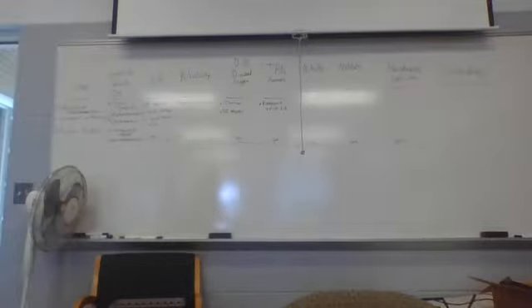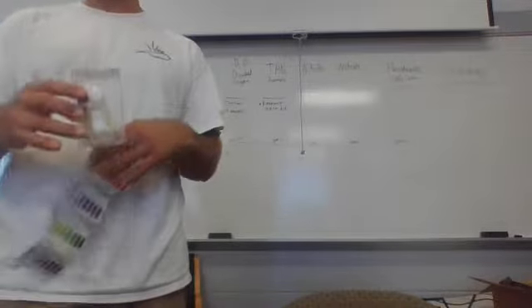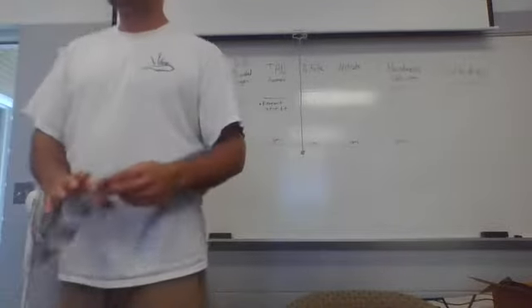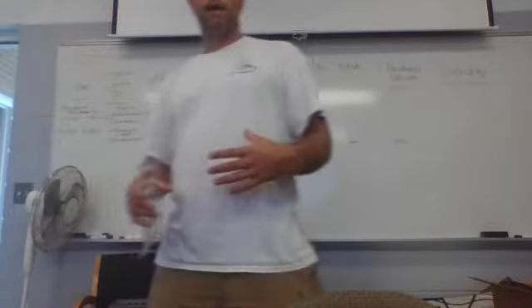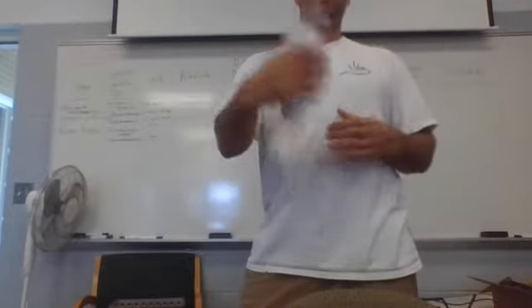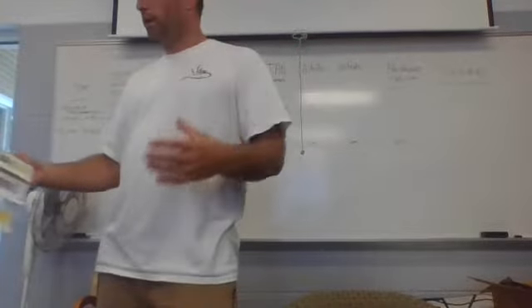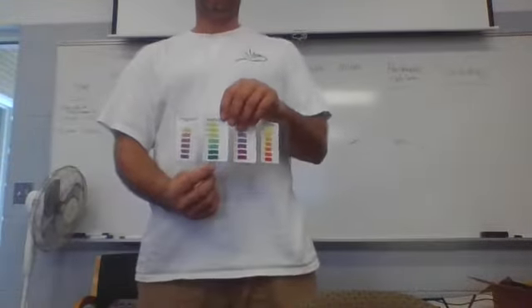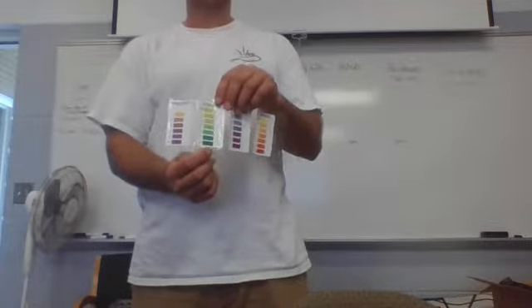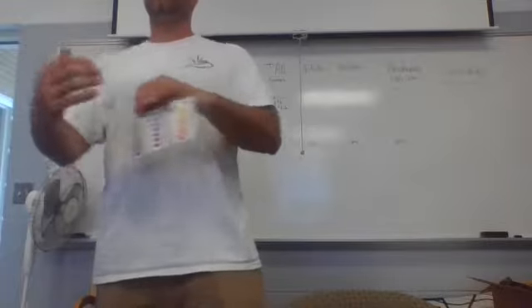The spectrophotometer test, again, same idea, same reagents, the whole 9 yards. It's just getting a better, more precise reading. Again, the range of the test is important. If you're outside the range, and that's why we did it systematically, because 8 is dark green. But you don't know, 6, 12, 20 probably is all dark green too. So you really need to figure out where on the scale you need to be.